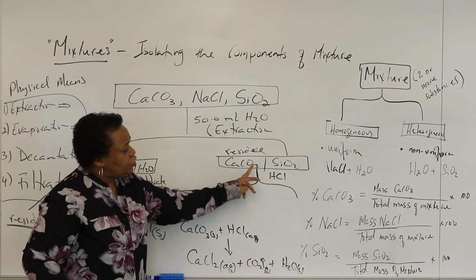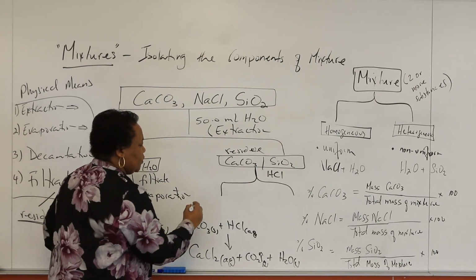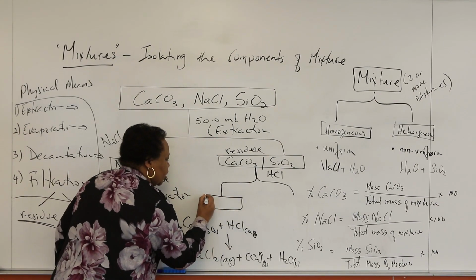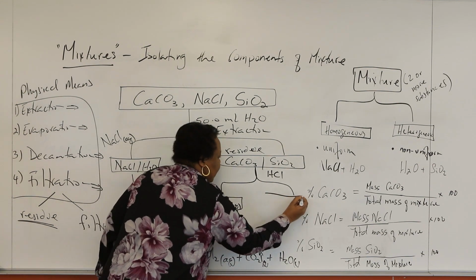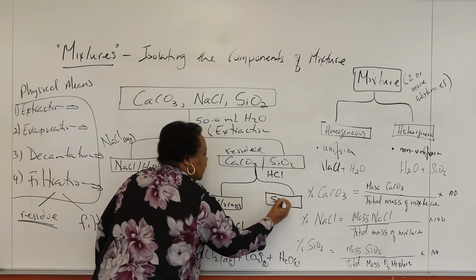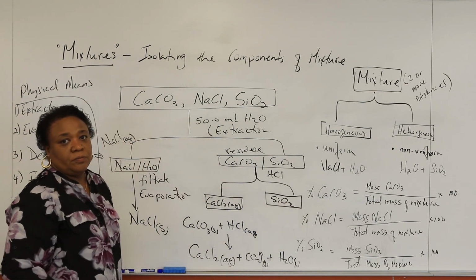And so when I do, of course, add the HCl, what's going to happen? Well, I'm going to end up, of course, with what? A solution of calcium chloride. And great, I finally have what? Just my sand alone, right?